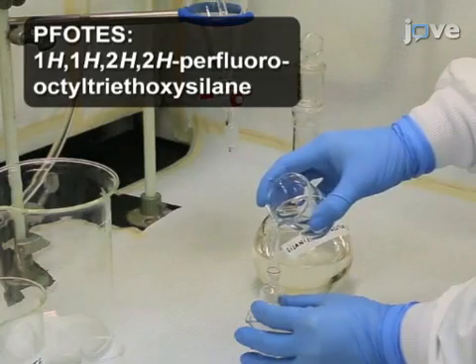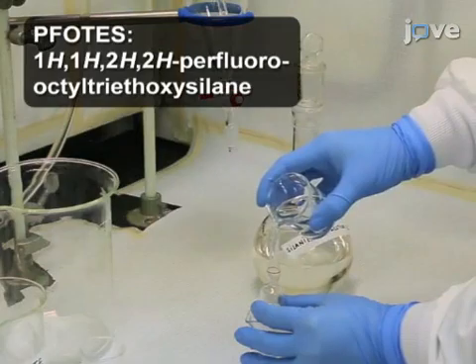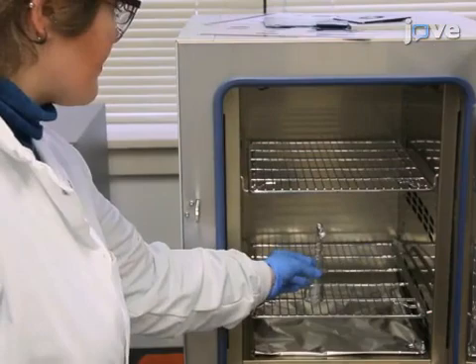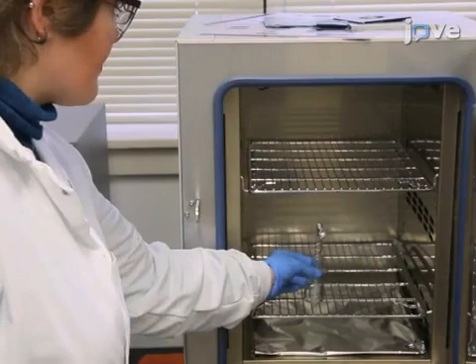First, fill a 20-milliliter ampoule with a 2% by volume solution of PFOTES in toluene. Stir the solution in the ampoule for 24 hours to silanize the ampoule interior. Rinse the silanized ampoule with isopropyl alcohol and dry it at 140 degrees Celsius for 30 minutes.